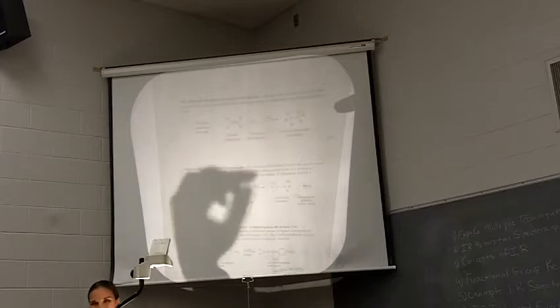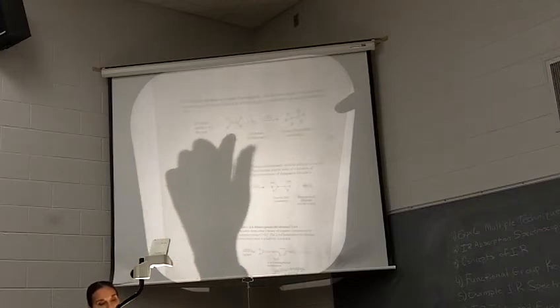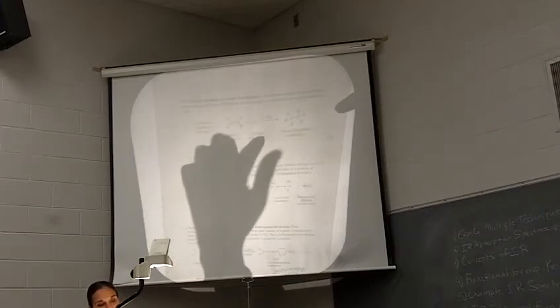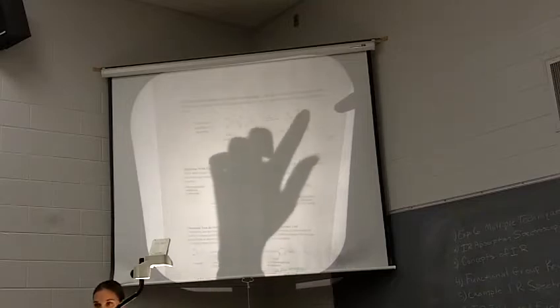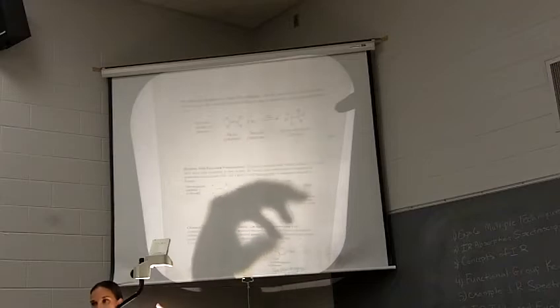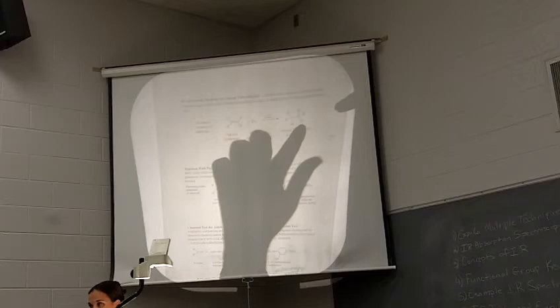The bromine is kind of a red-brown color. And what happens is when you add this red-brown color to this colorless alkene, it turns colorless, okay? So it looks like it's kind of the opposite of what you expect for the reaction. You're going from colorless, add red-brown, and it goes colorless again.